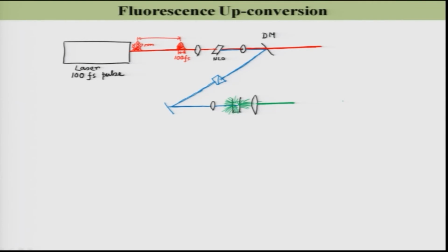Okay, what do you do with this red light? You take this red light and make it come back from here to here to here, and put a mirror here, and you make it come over here.